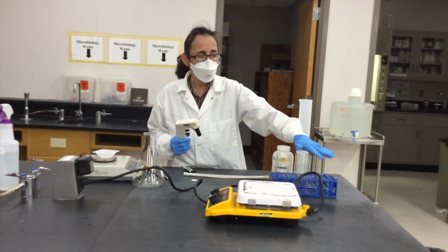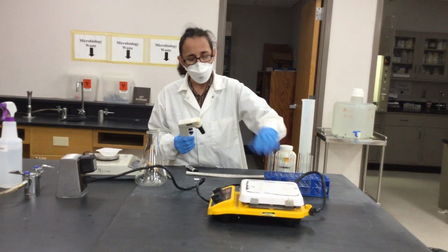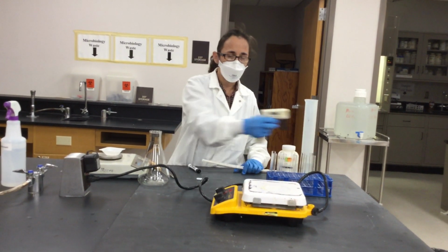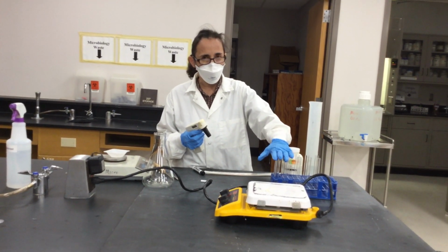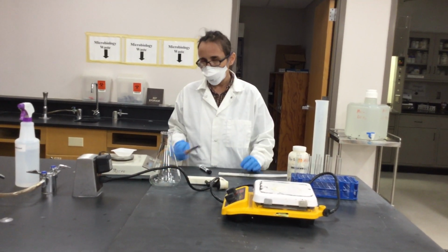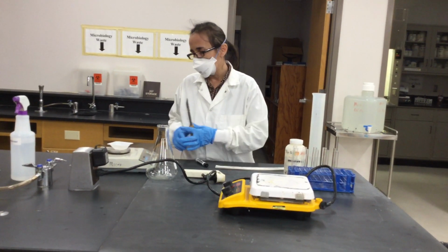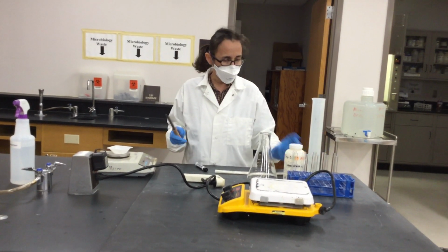We need to cap this to close the end of the tubes, and then you have this pipetter and a pipette, so you can add the amount of media that you will be adding per tube. And again, it's 10 milliliters of media per tube. So I'm going to weigh 4 grams, and you need to have your spatula, and then you have to calibrate to 0 or tare your weight scale.